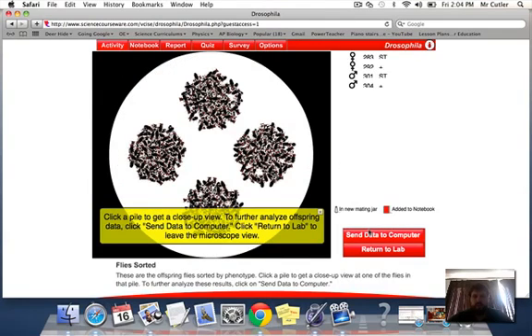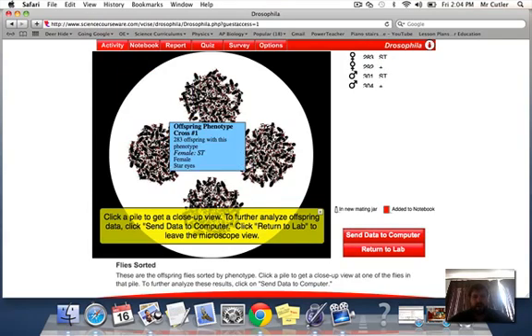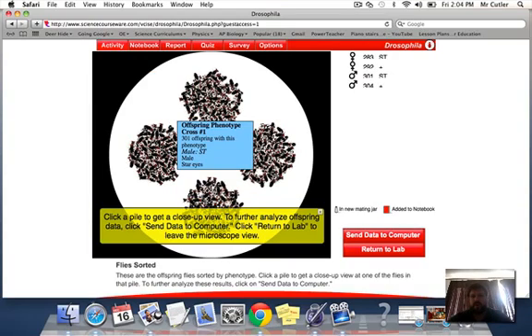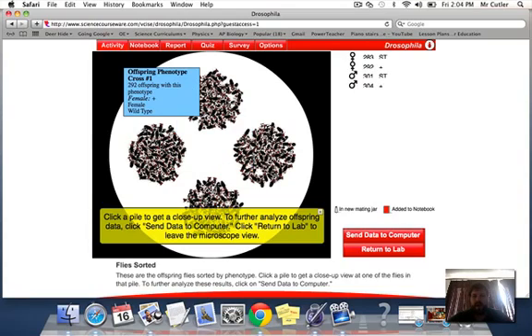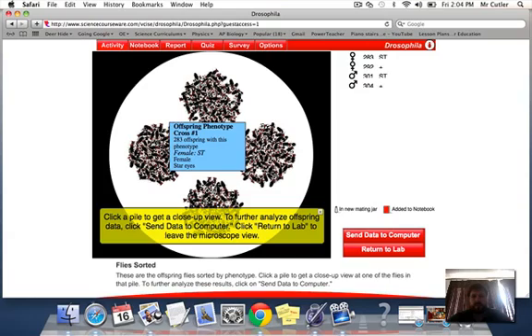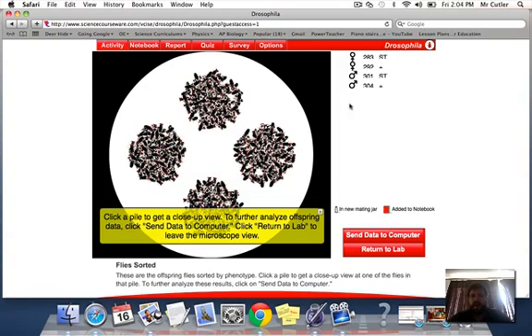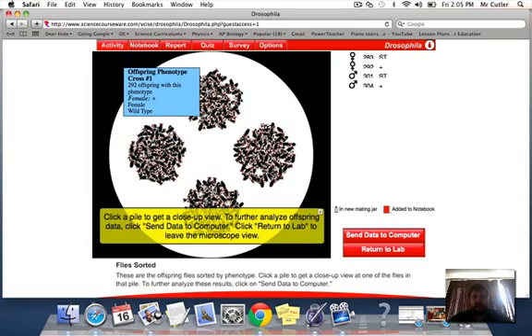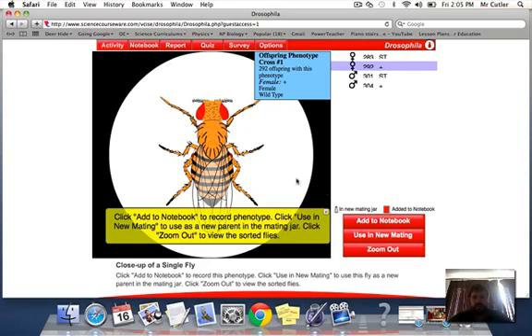I'll sort them out and you see I have some star and some wild type. So there is something a little bit interesting going on here that the star doesn't seem to be completely recessive to the wild type. Regardless, I want to take an individual that is heterozygous. I know that the wild type female will certainly be heterozygous because her mom was homozygous dominant for both traits and her father was homozygous recessive for both traits. So the mom is definitely going to be heterozygous, so I'll find that wild type female, which is right here.